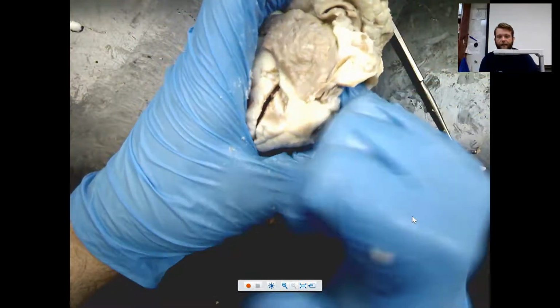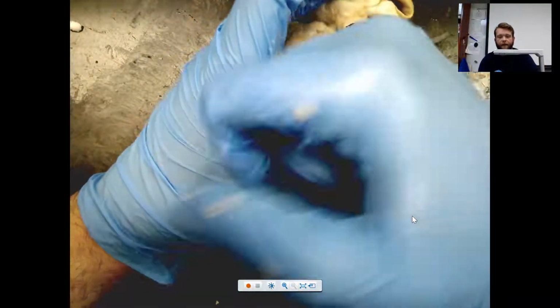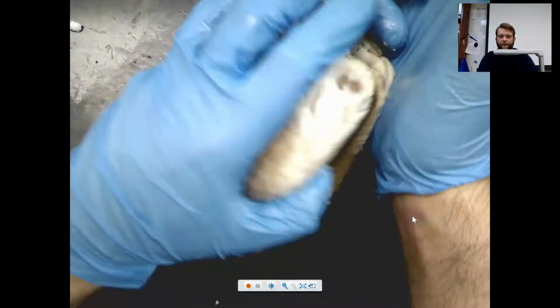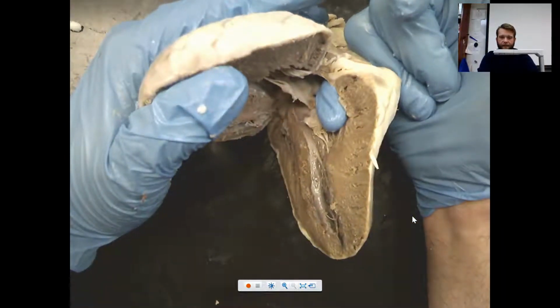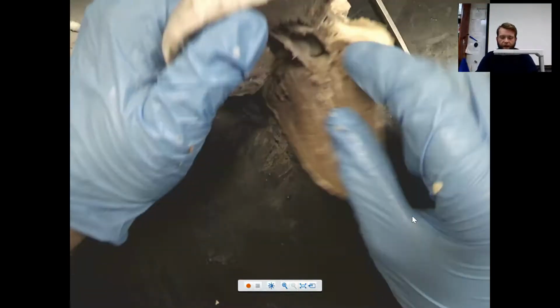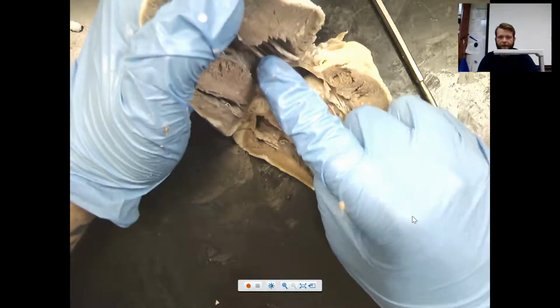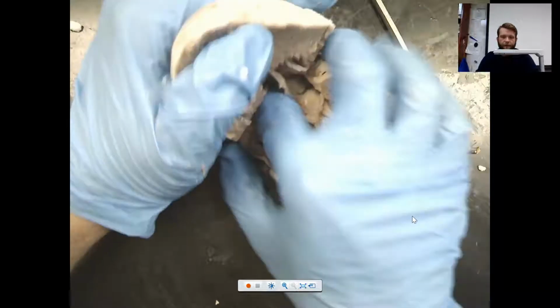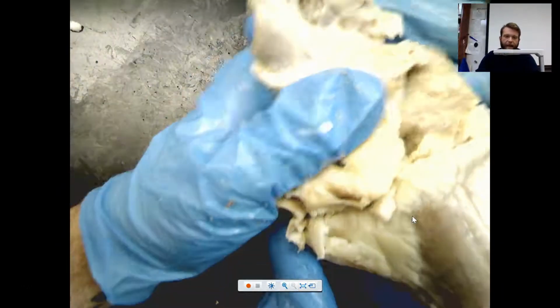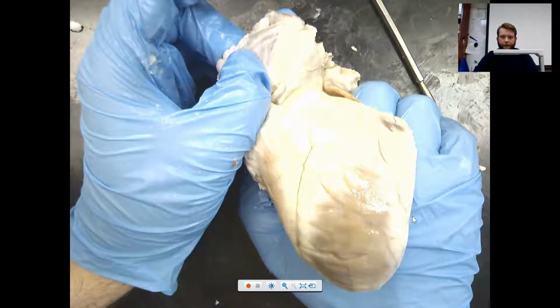In our left atria here, we're going to have another atrioventricular valve. If you look at my finger here, this is my finger coming from the lungs. So blood is entering this small chamber here, the atria, and then from there it goes through this valve. You can see all the chordae tendineae and the papillary muscles. It comes through this valve into the left ventricle, and then out the left ventricle. It's going to go through the ventricle and then out my aorta. If you see here, my finger is coming back behind. This is where my aorta is leaving.